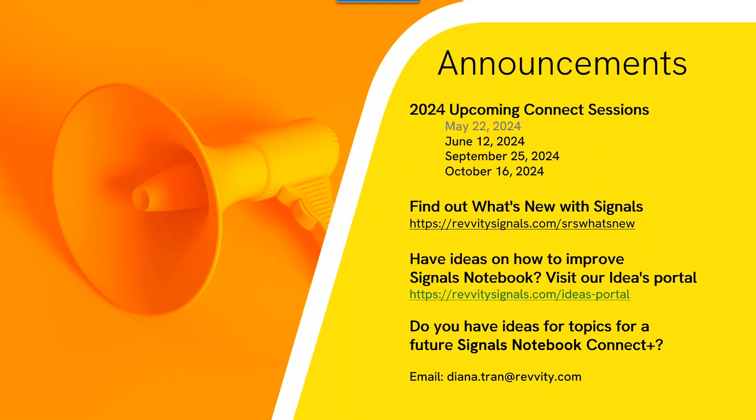Thank you. Can Signals Notebook support other scientific workflows? An example is formulations. The short answer is yes, and the longer answer is we would really love it if you come to our May 22nd session. Obviously, for obvious reasons, we will be focusing on formulations, but to extend that, today we talked about a smaller subject of T cell isolation for T cell activation.